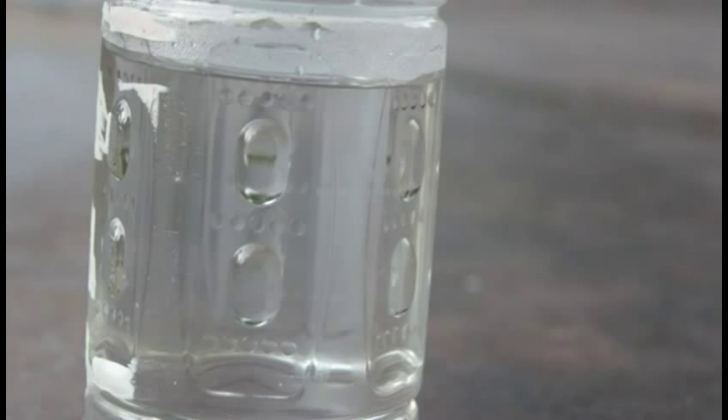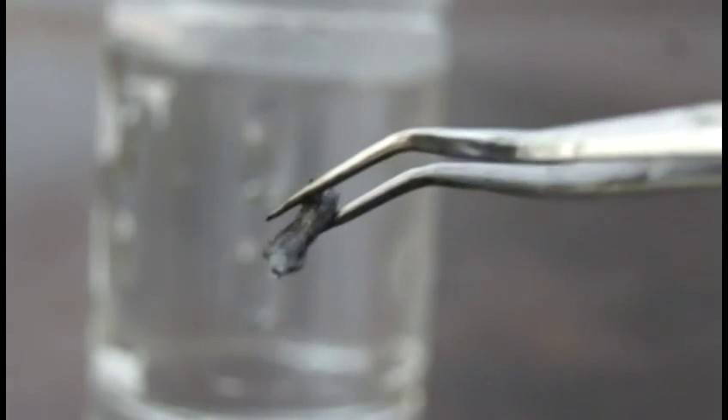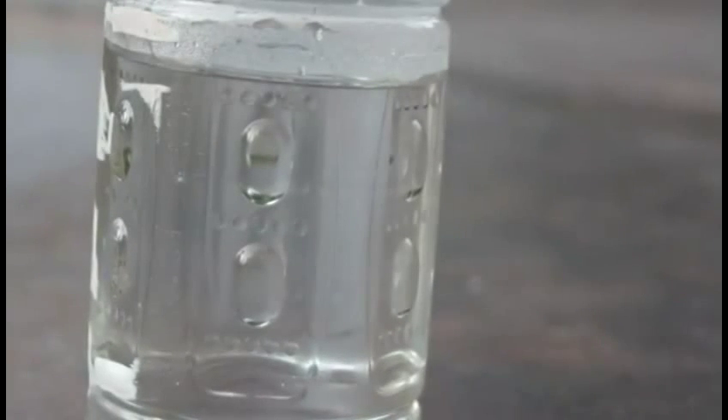Strontium or barium. Not to be a spoiler, but the barium will win because due to its lower electronegativity — I assume I'm right about that — it will be more reactive. So as you can see, we have strontium and barium.